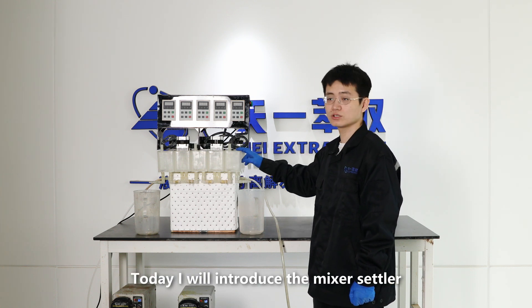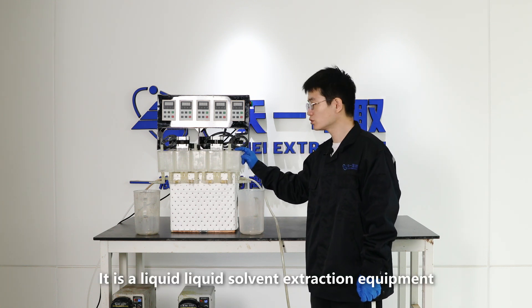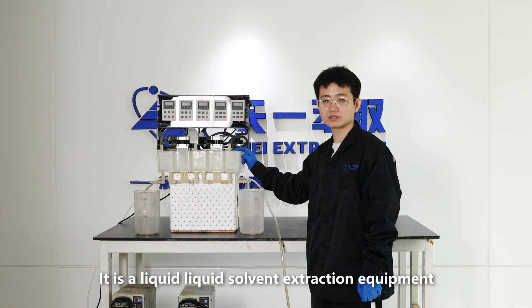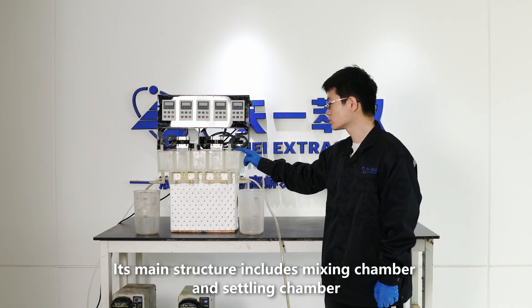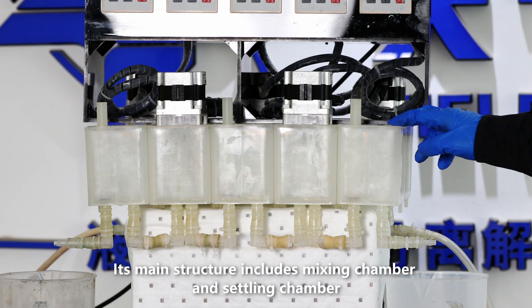Today I will introduce the Mixer Settler. It is a liquid-liquid solvent extraction equipment. Its main structure includes mixing chamber and settling chamber.